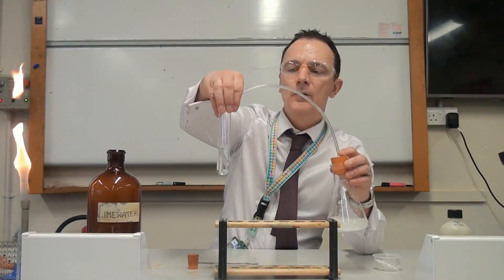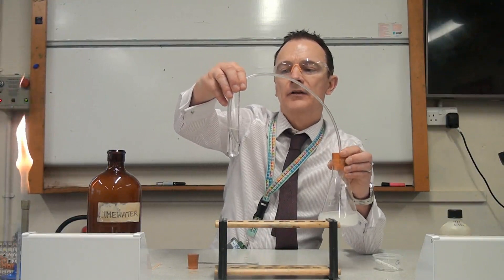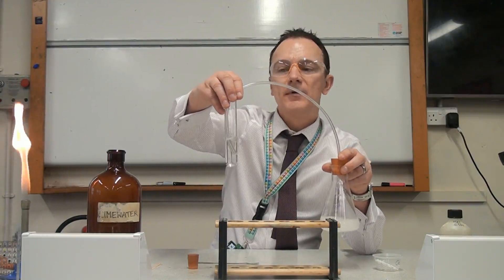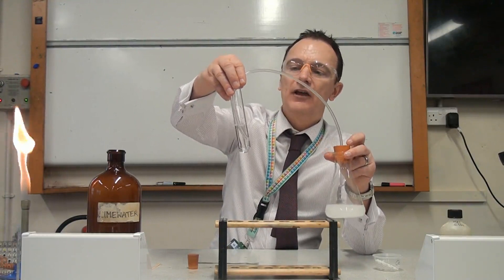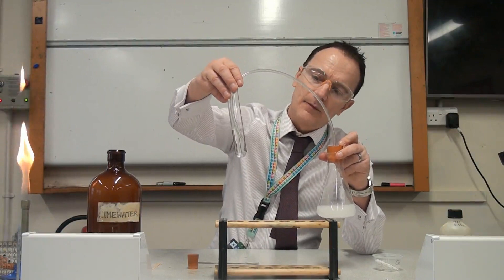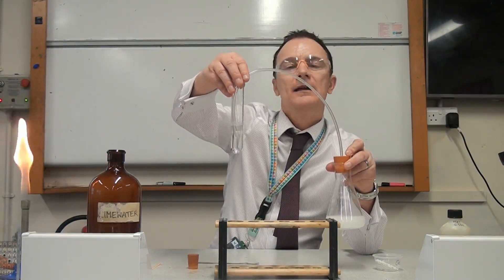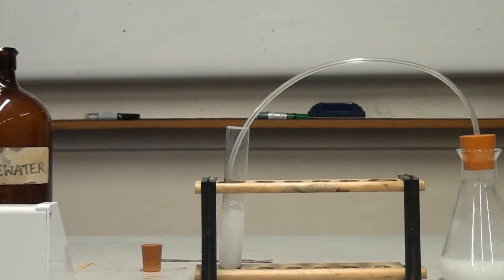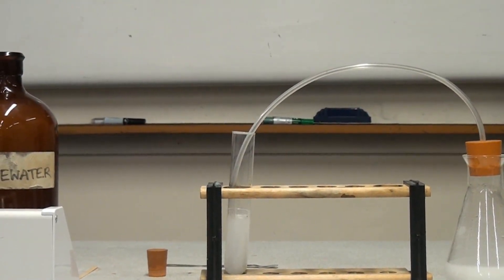Over time we should see the lime water starts to go cloudy or milky. In an exam your two marks would be: one mark for saying to test for carbon dioxide use lime water, and the second mark for saying it should go cloudy or milky — both of those words are acceptable. We can start to see it going now, and we'll come back in a minute to see it's gone a little more milky.